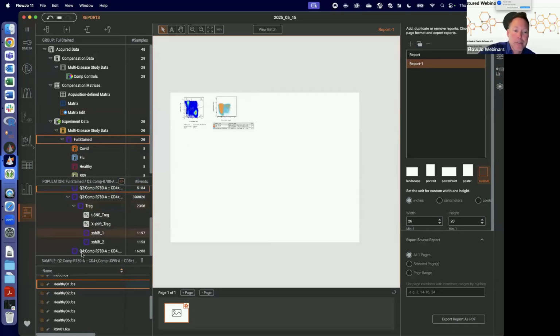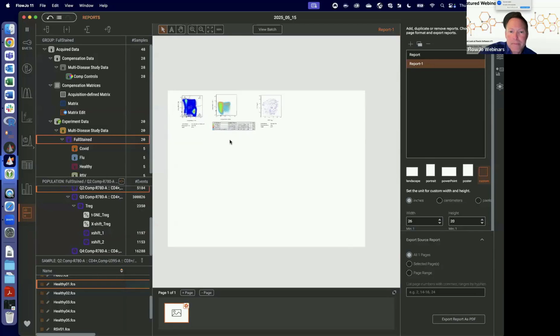An overlay is created just by dragging and dropping on top of stuff, similar to everything we've ever done. If you drag in one of these nodes, the TCs or the X shift, you get the particular report for that item. So there's our t-SNE plot for these. All right, yeah, we'll go with that. Okay, so I've got three plots for one of the samples.